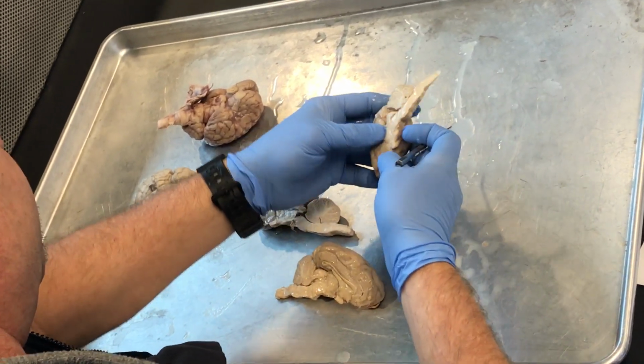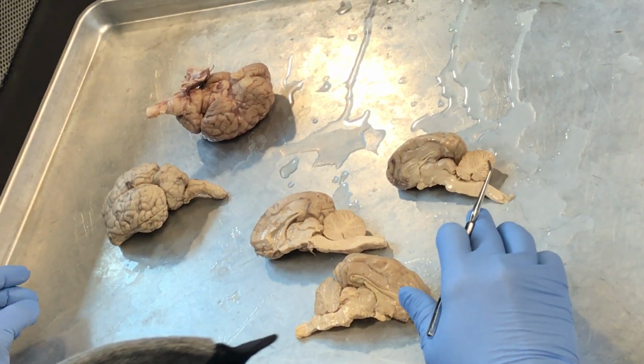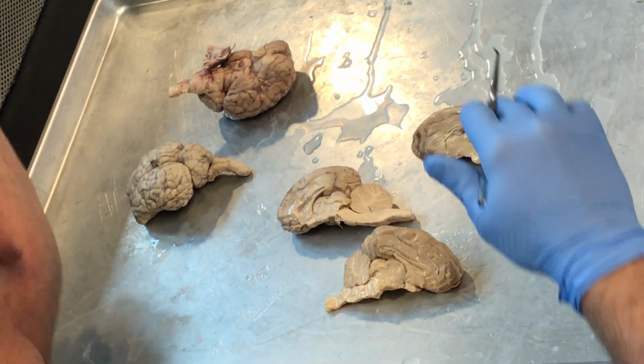We're gonna open that up a little bit. I might need to get another sheep brain, yeah. Hey, can one of you see if we can find a pineal gland on a mid-sagittal cut on some of the sheep brains that are already out? This one doesn't, none of these have it.